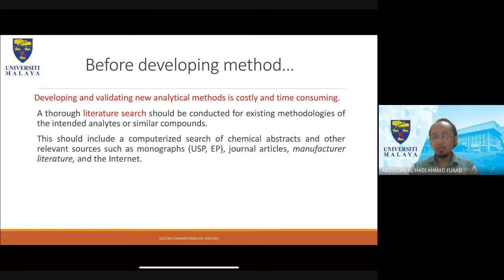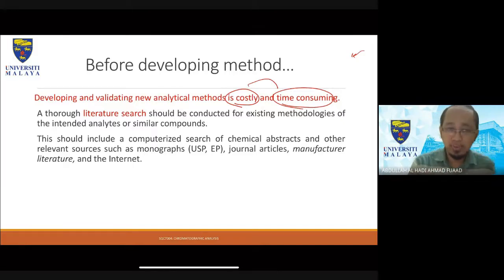All right. However, before you develop a method, developing and validating new analytical methods is costly and time-consuming. So this is something that you need to know. If you want to work with a new sample, then you need to think about one is the cost, and the second one is time. It might consume a lot of time, and it might increase the cost. Okay, so these two are related. The more time you need to spend in developing your method, the higher the cost.